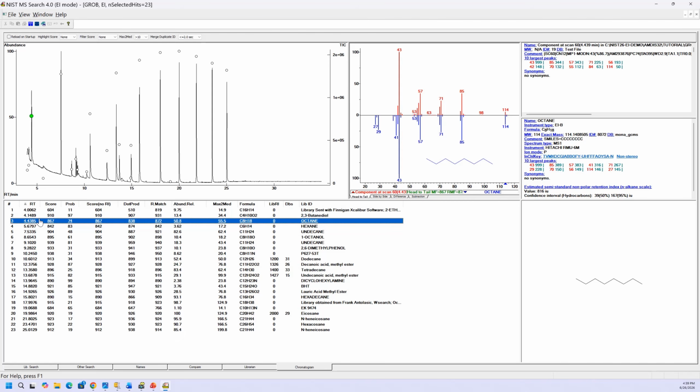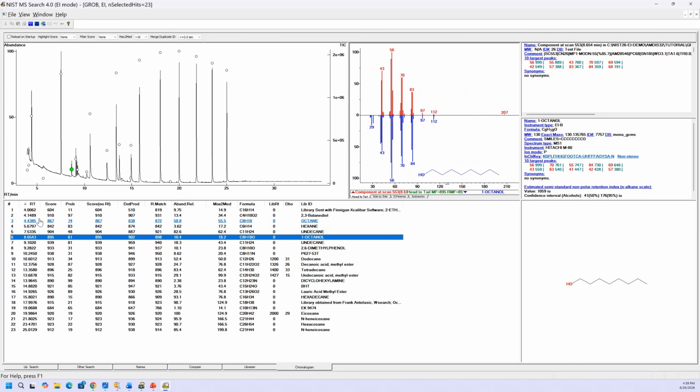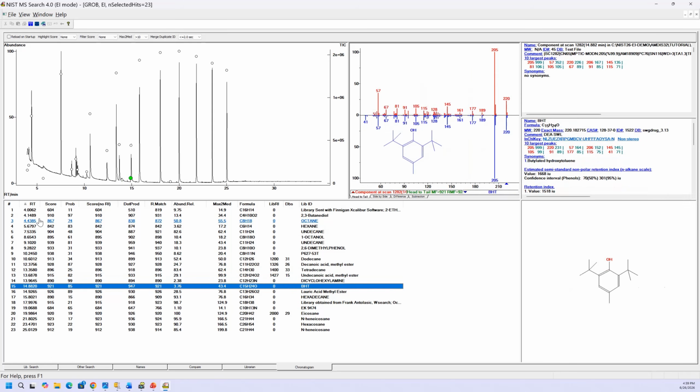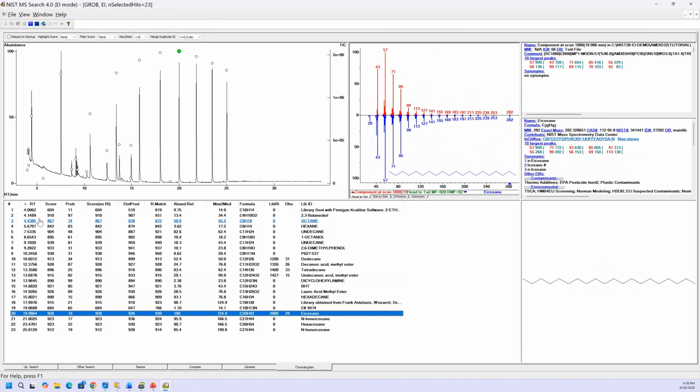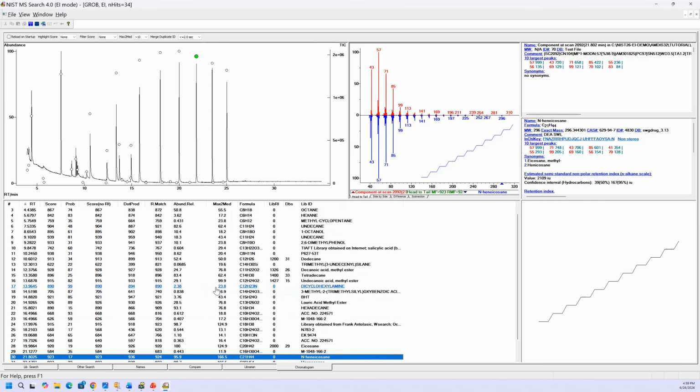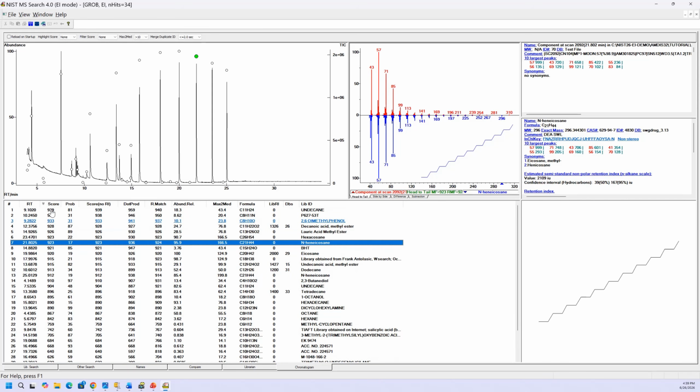So I'll start there. And now you can just step through them and look at the big peaks that way. So there's lots of ways you can sort things, and you can always reverse things if you want to. Nothing really ever totally goes away, so we can right click here and say show all, and it'll go back to the other display. So another way you might like to sort is look at everything above a certain score, things that have been identified.